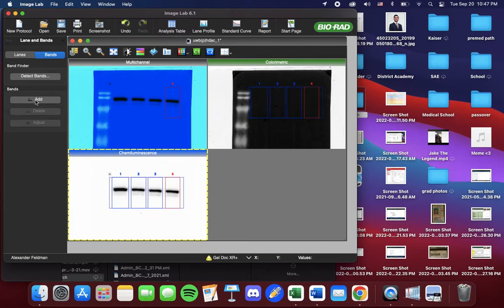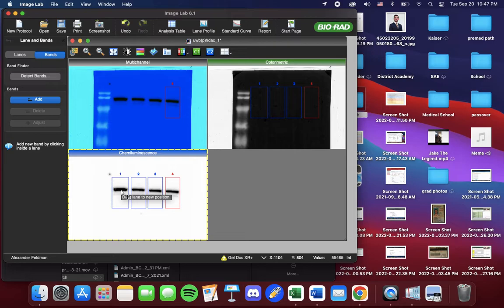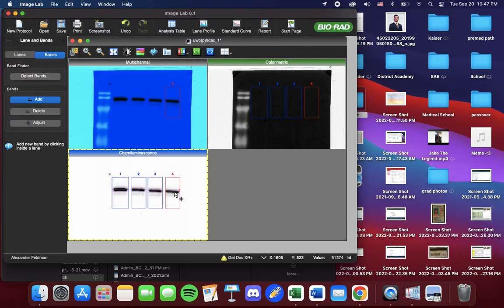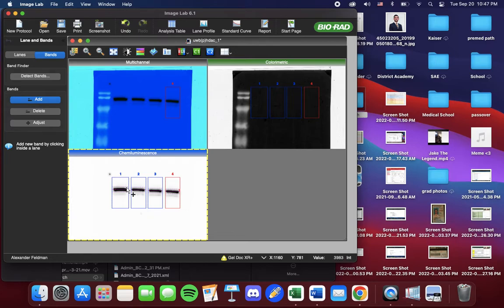Under Bands you say Add and you're going to select each band by clicking on it. And it will automatically detect the band and the range.